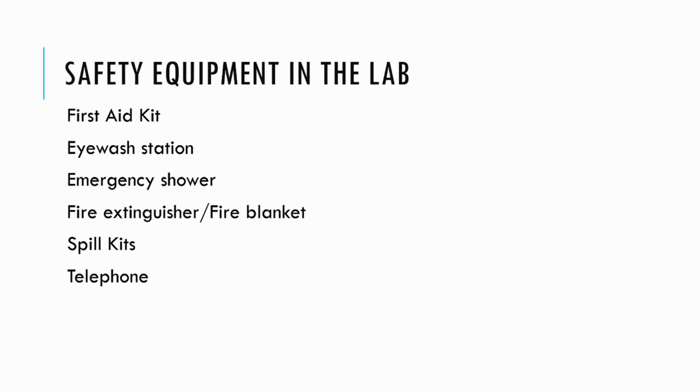And lastly, a telephone. When in doubt, call for help. Your instructor should be informed on how to handle most, if not all, of these problems in the lab. But if it's something beyond you, your classmates, and your instructor's control, then the telephone is a wonderful tool to use in order to get someone out of the room, to have some sort of hazard taken care of, or to get someone help or treatment that they might need in the case of a very severe accident.